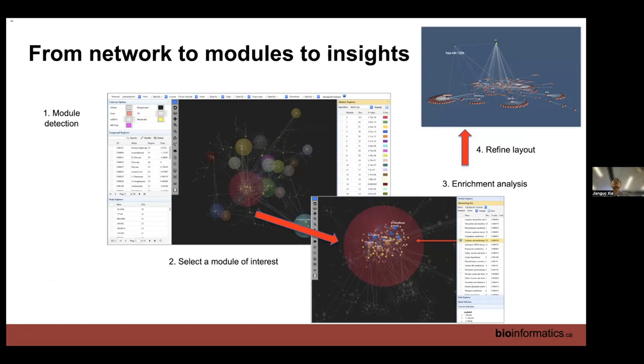I mentioned that if we play 3D games, we can do the same thing, have a 3D network. In each network, we can have modules, with entire modules wrapped inside a bubble, so it becomes more simplified. We can click this bubble to make it the focus, and all the background will fade away. Then we can rearrange and extract it and see what's inside this network. You can see here microRNA with a lot of things, probably the major regulator. So when you see the pattern, you zoom in and do more focused analysis. This is a multi-omics complex system, and we can make it simpler and still get what we want.